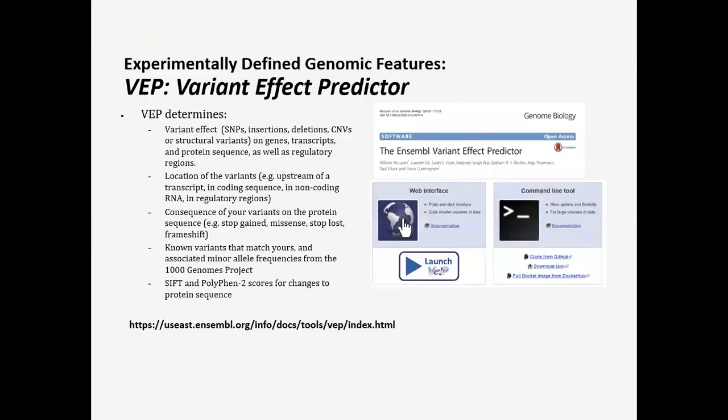Excuse me, ma'am. Yes. When we're talking about an NIPT sample where we identify a BRCA1, BRCA2 mutation, then this step is not applicable for this purpose, right? Directly we get the results, no? And we can find out whether there is a BRCA1, BRCA2 mutation or not. That is a known gene, right?